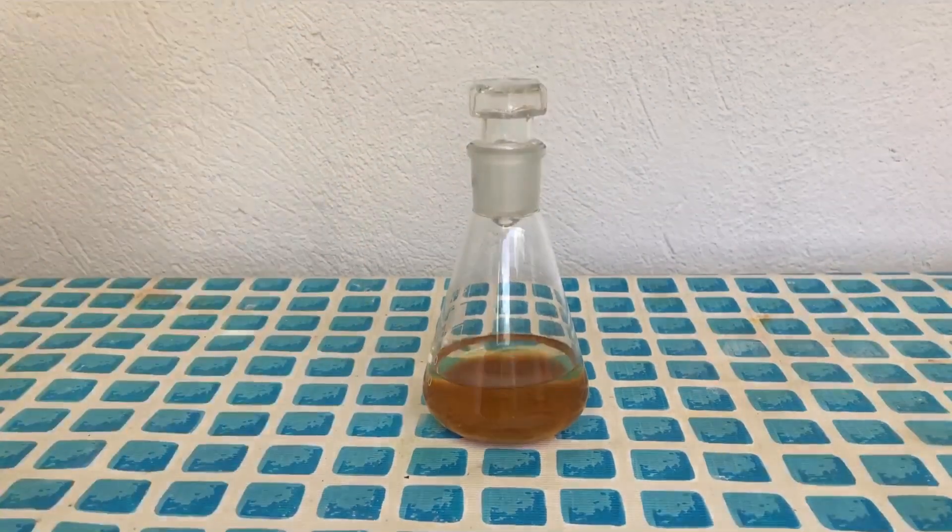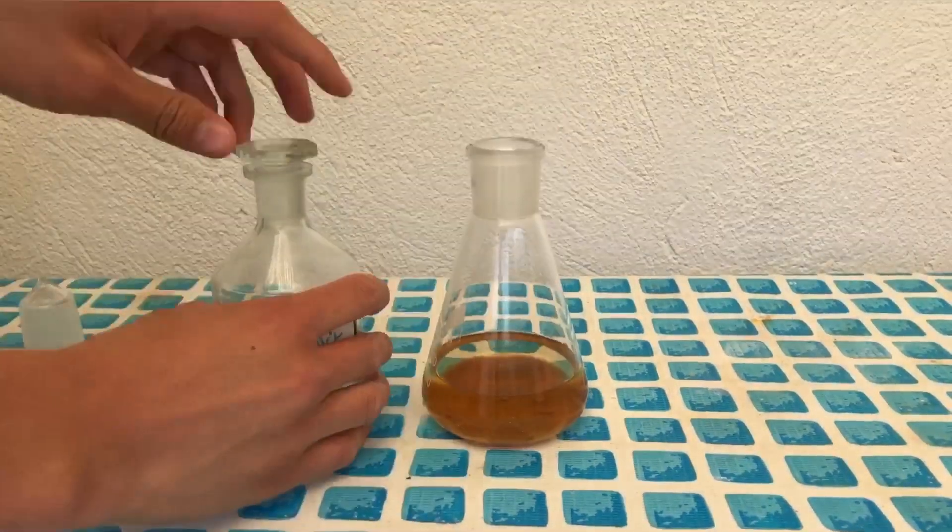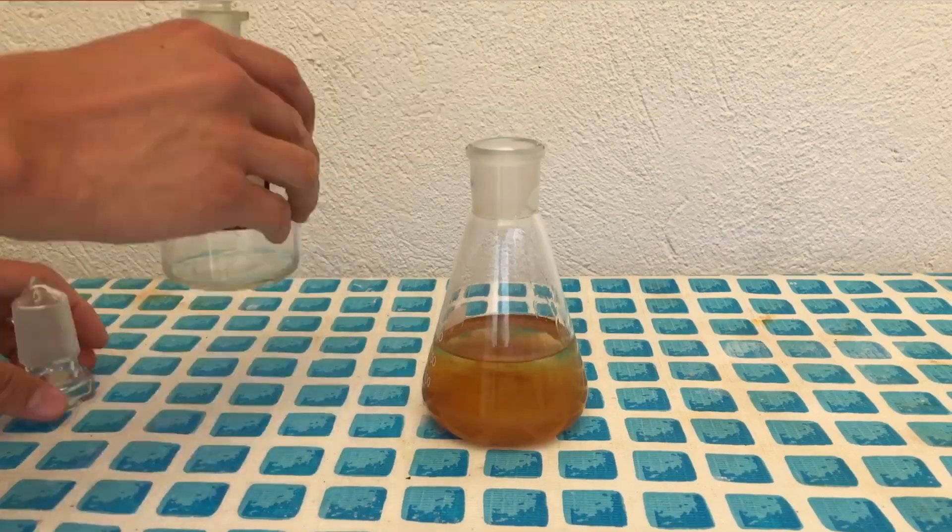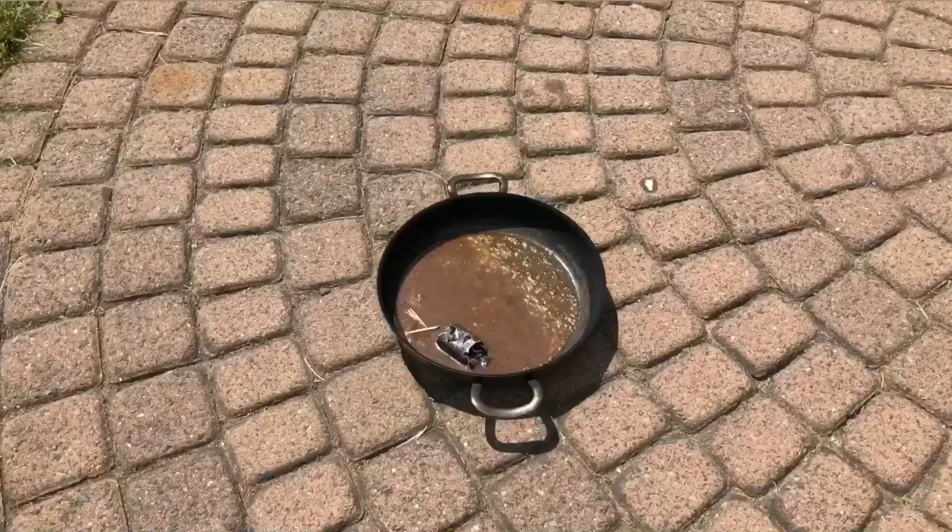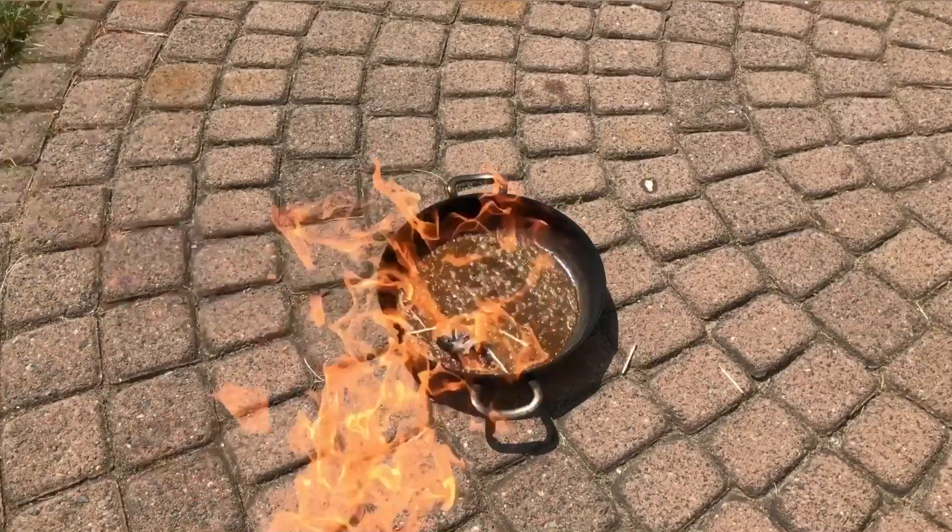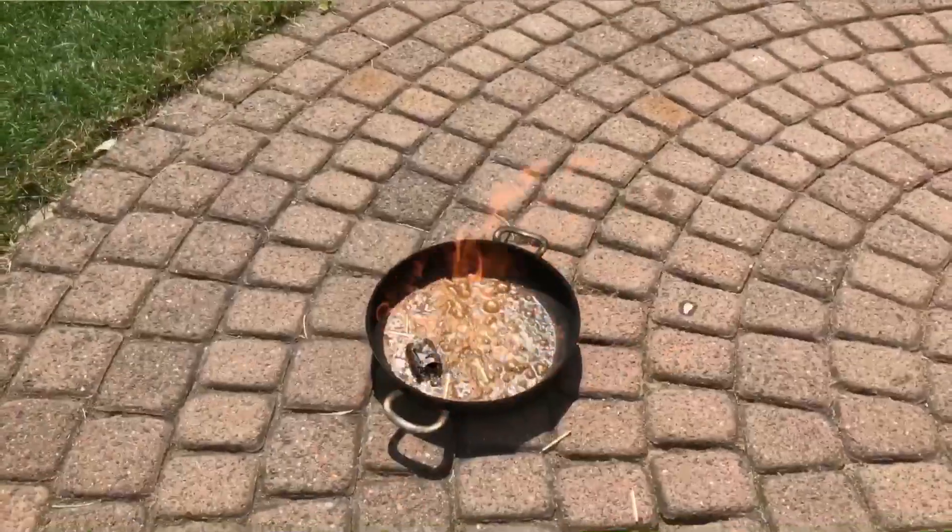The ether was decanted into this Erlenmeyer flask as best as I could, some crap made it over, but we added distilled water afterwards, shook it up, and removed whatever of the ether, sodium hydroxide and iron hydroxide stuff was left.